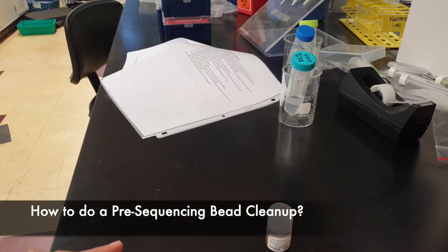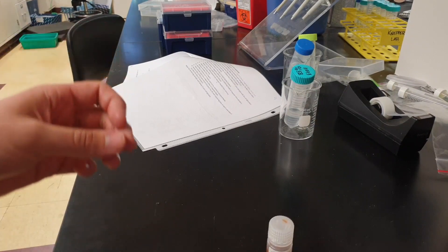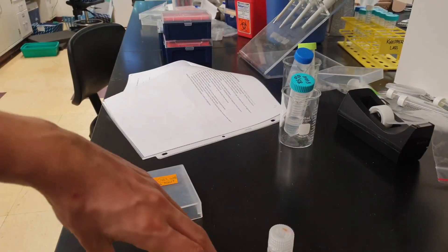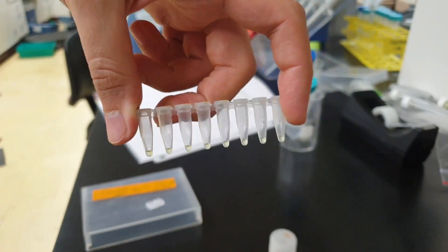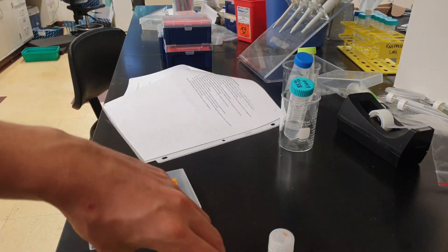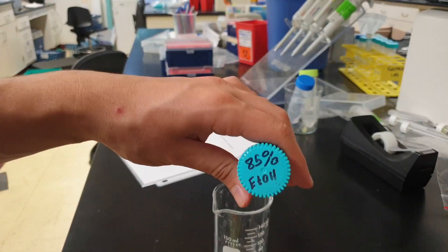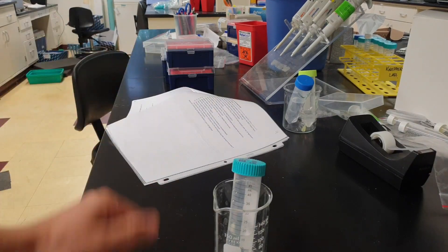Hi everyone. In this tutorial we're going to be doing the pre-sequencing bead cleanup. This step is done to remove any excess dyes before we take our product into the sequencer. What we have here are our post-pick dye sequencing products — about 10 microliters in each tube. We have AxiPrep beads and 85% ethanol. It's going to be several steps, so let's get right into it.